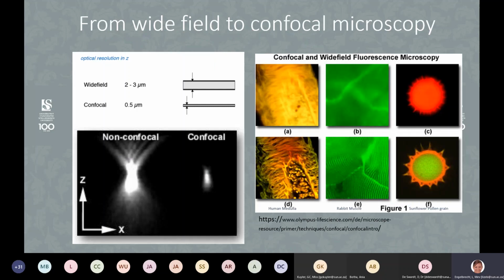Right, so the previous presentations talked a lot about different types of microscopes. We talked about wide field microscopes or epifluorescence microscopes. Many labs have epifluorescence microscopes. They're the typical ones that have fluorescence, but they're not the top of the range. There are very limited confocal microscopes in South Africa. I know of only UCT and Stellenbosch who have confocal microscopes in the Western Cape. There is also one at Grahamstown and at UKZN, Wits and Pretoria, and I think there's MRC also, but there's really only one confocal microscope per institution often here in South Africa.